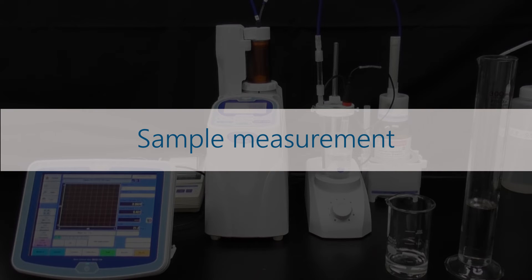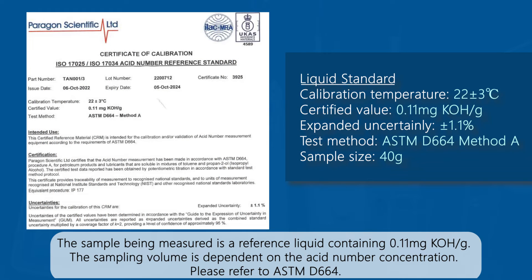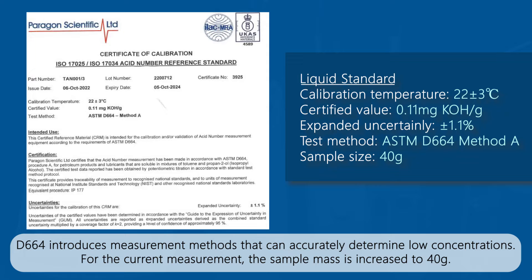Sample measurement: The sample being measured is a reference liquid containing 0.11 mg potassium hydroxide per gram. The sampling volume is dependent on the acid number concentration. Please refer to ASTM D664. D664 introduces measurement methods that can accurately determine low concentrations. For the current measurement, the sample mass is increased to 40 grams.